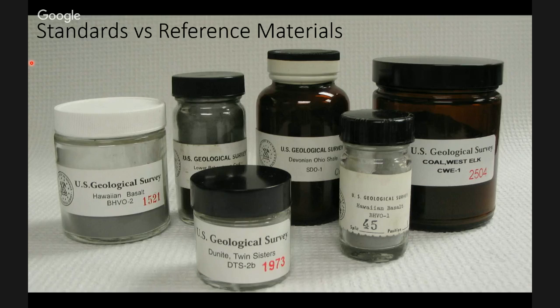Okay, so hopefully these three videos have given you an introduction to the kinds of things that matter for mass spectrometry and geochemistry more generally. You have an idea of what mass spectrometers are, what types there are, and I think most importantly is this last video about the things that you need to worry about when you're dealing with this kind of geochemical data.